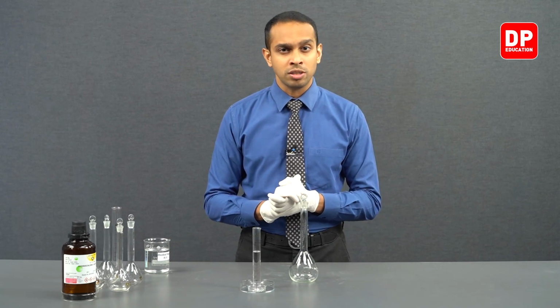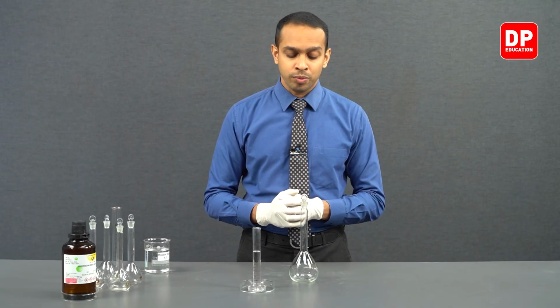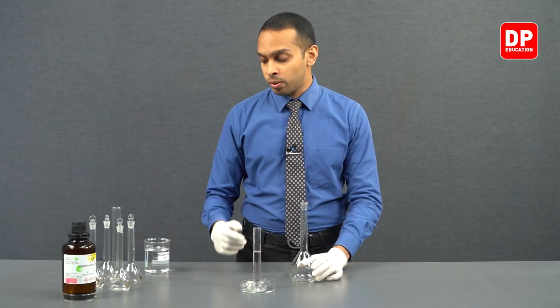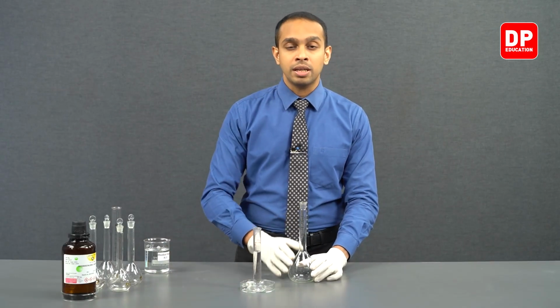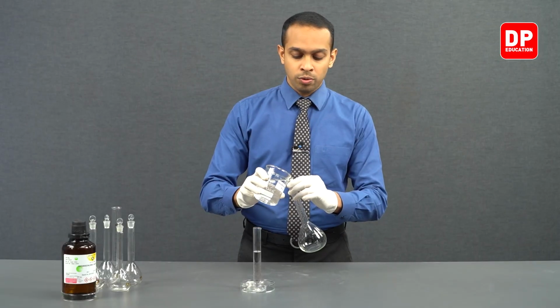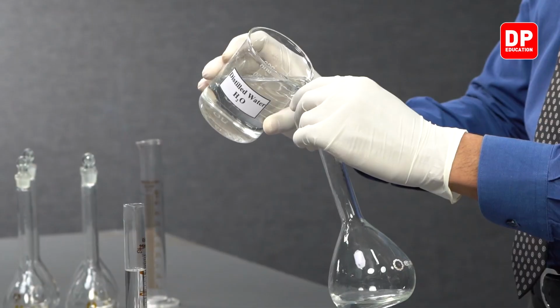So therefore, you will not necessarily see a huge increase in temperature. So to avoid any splash hazards or cracking of any glassware, we are going to first introduce a small amount of distilled water into our volumetric flask.